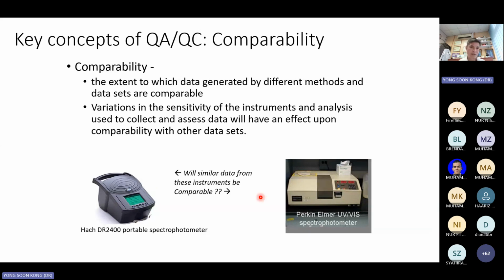But based on the requirement, if you want your reading to be absolutely accurate, it's best that you bring your water samples back. But then again, ada sample yang you tak boleh analyze bawa balik kan, because like you said, water holding time, you have to analyze immediately. So bawa ke site, lower accuracy, tapi tak apa. At least kan, you have a better trade-off in a way that you manage to capture the actual data on the spot, and you are not suffering from the degradation of holding it too long, and you get a lesser accurate result.